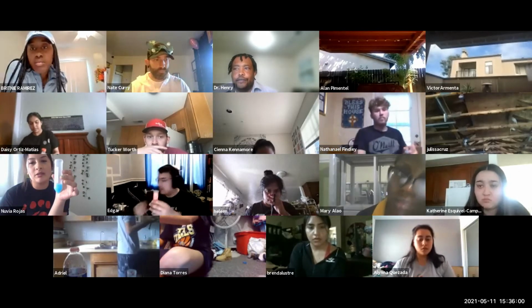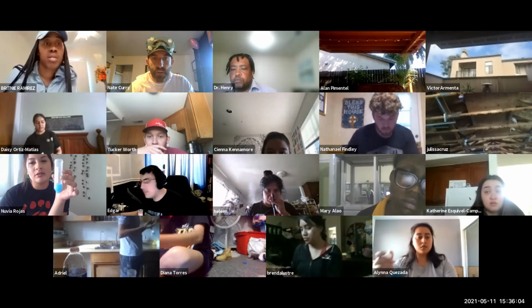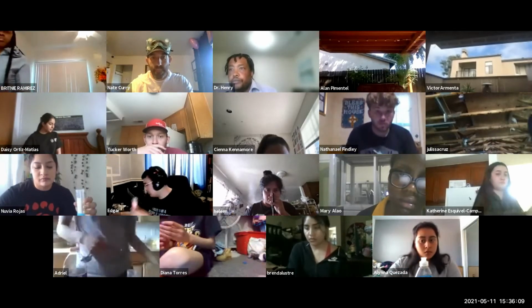To the one with 10 mLs? That is correct. When I added the baking soda, my volume went crazy, all the way up to 50 milliliters. How much?